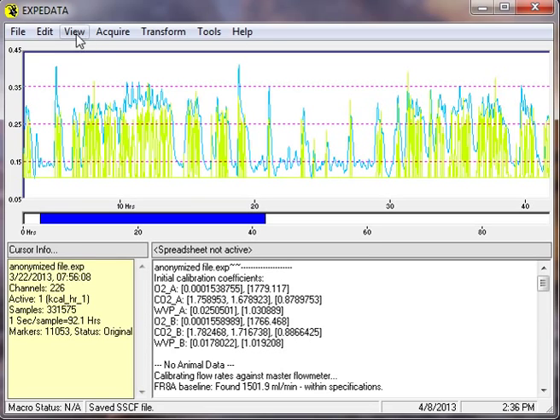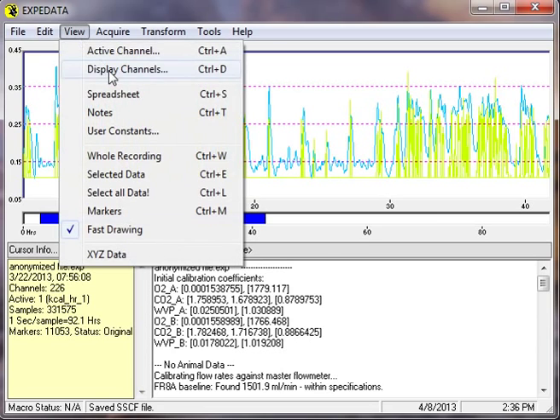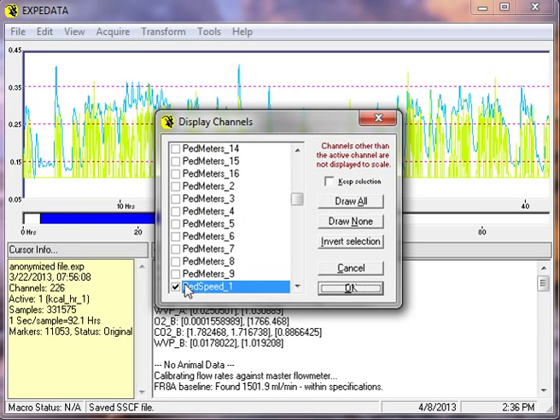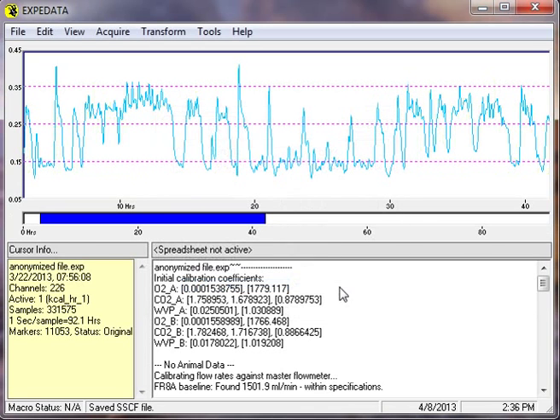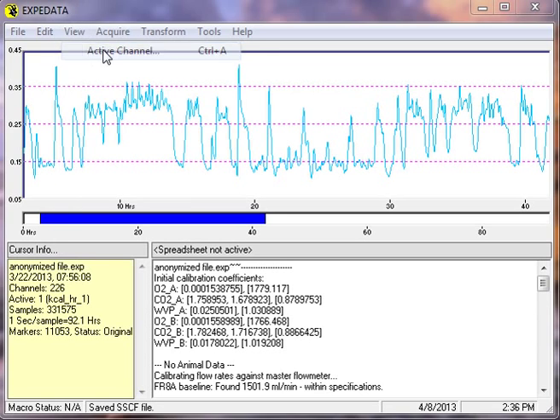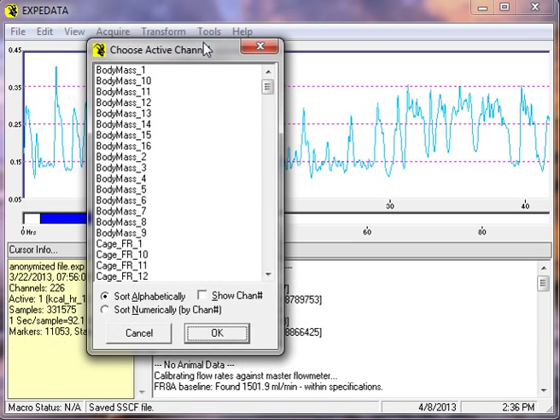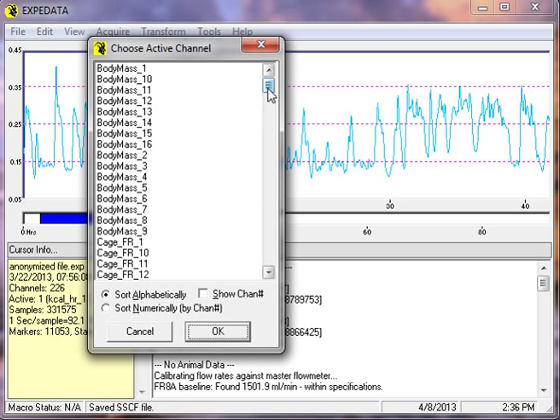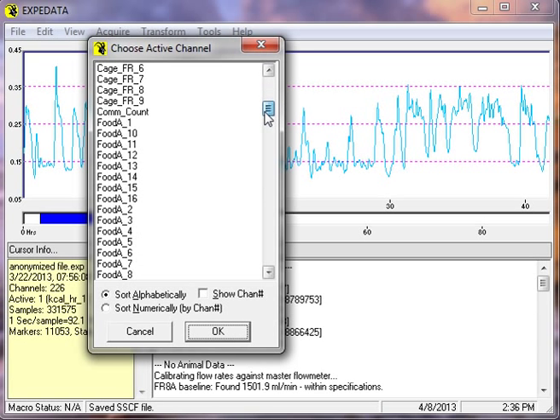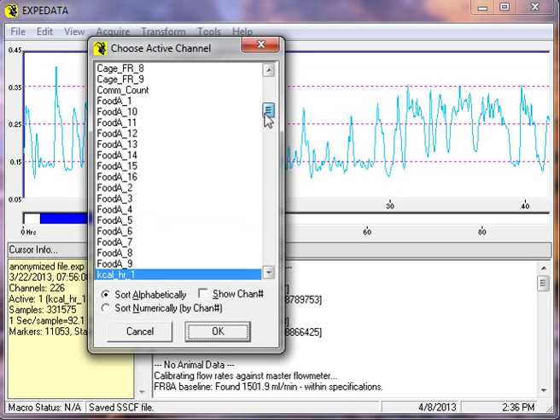And to do that, we're going to go ahead and turn the display of pedestrian speed off for the moment. We'll come back to it later. And then for the active channel, the one that we're primarily looking at, we're going to choose the food channel.